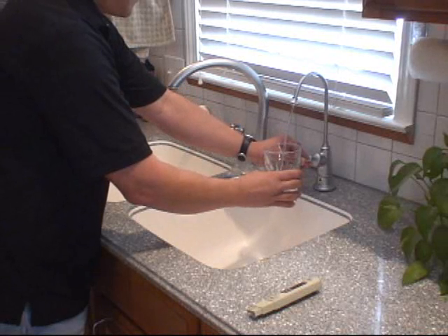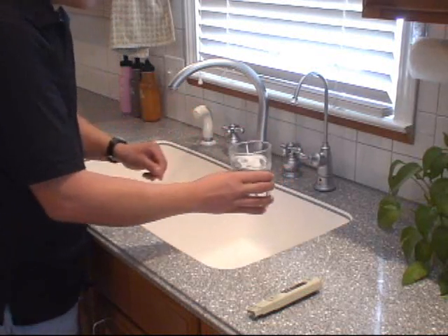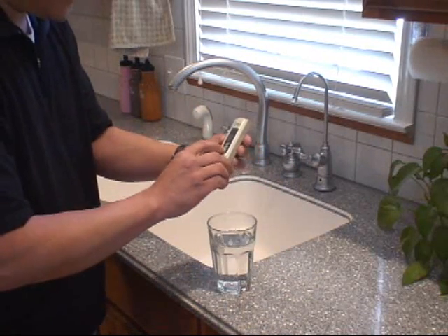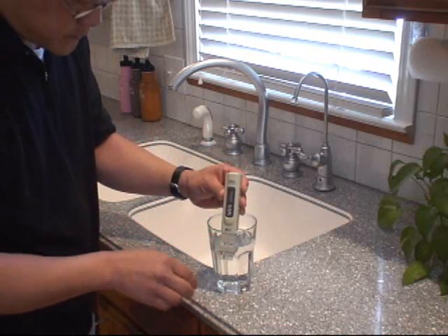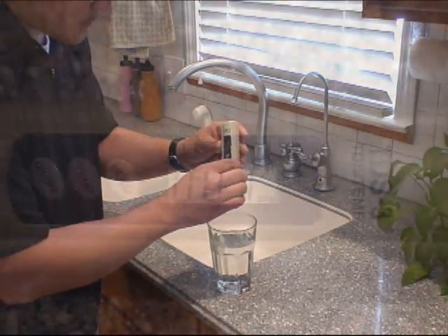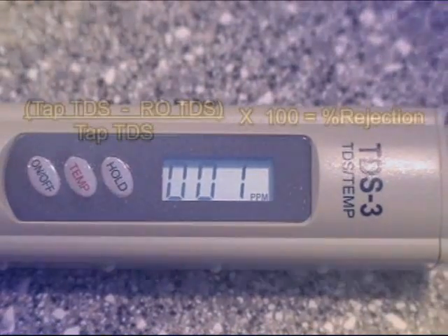Now, fill up your glass of water from your RO water dispenser. Then, take your TDS meter, press the ON button and place the probes into the glass of water. Press the HOLD button to keep your reading in place. Then, record the RO TDS reading.